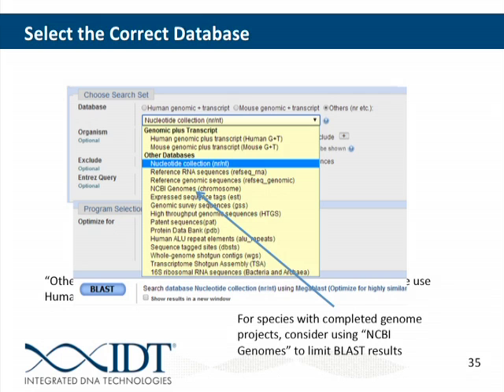Yes? So your reverse primer sequence should be reversed when you put that in there? It should be, yeah, it can be. Otherwise, just keep in mind that instead of having a plus/plus and a plus/minus output, they're both going to be plus/plus. But ideally, yes, you'll put the forward primer forward and the reverse primer in the reverse orientation.